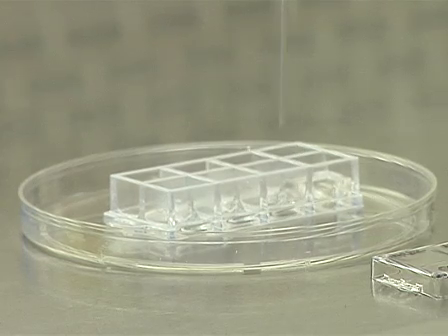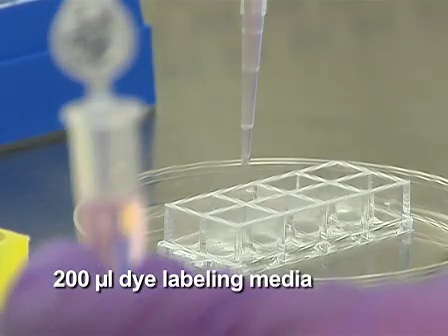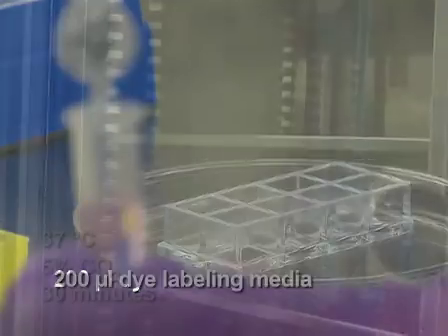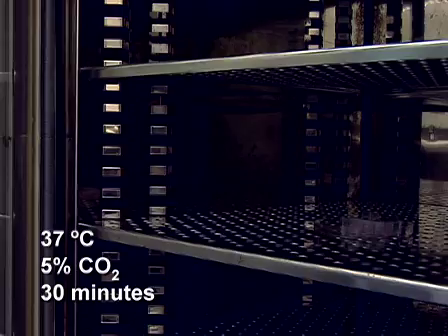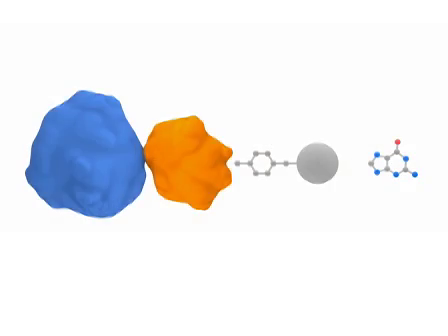Carefully remove growth media from the samples and add 200 microliters of dye labeling media to each well. Incubate samples at 37 degrees Celsius, 5% carbon dioxide, for 30 minutes. It is at this step that the benzyl group on the TMR substrate will covalently link to the SNAP tag and release guanine.